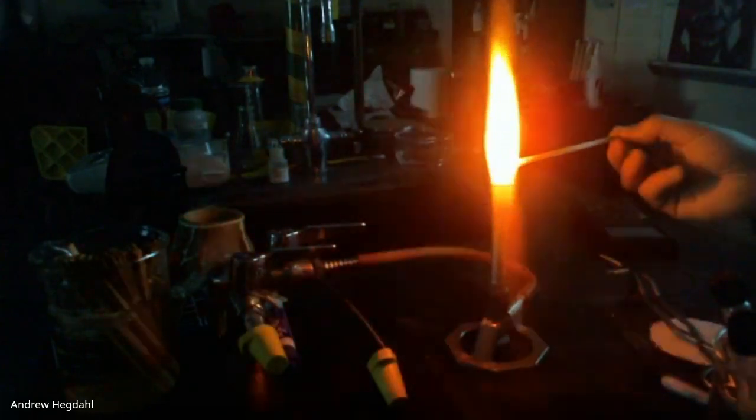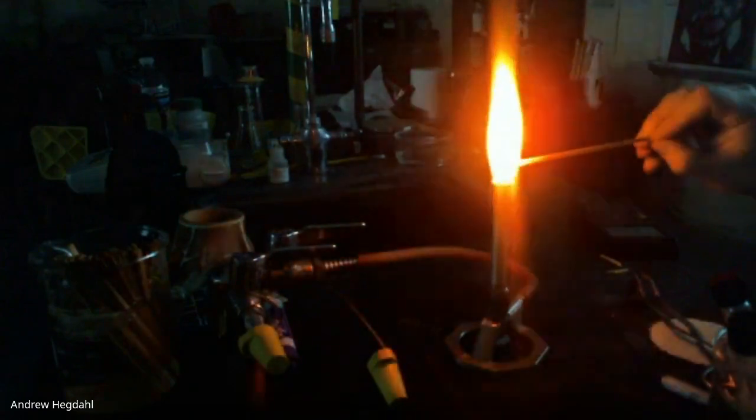And we got letter G here. Ooh, G's got a very red color. This is a really bright red. So I think you have crimson, which would be the darker red, and this would be the brighter red in your key. This one's definitely bright. I put bright red for this one because I think that matches one of the metal descriptions. Your other red one would have been like the crimson color. All right, that's that one.